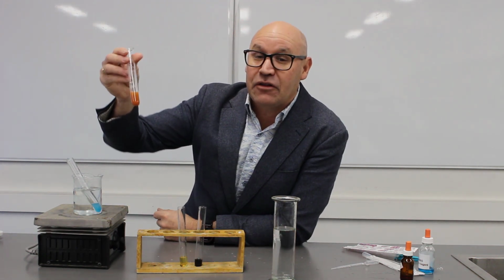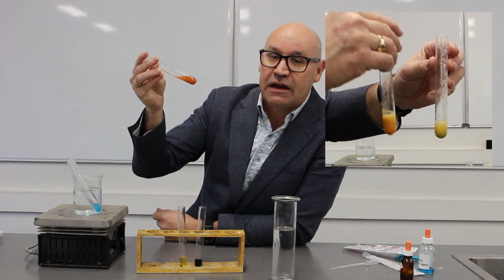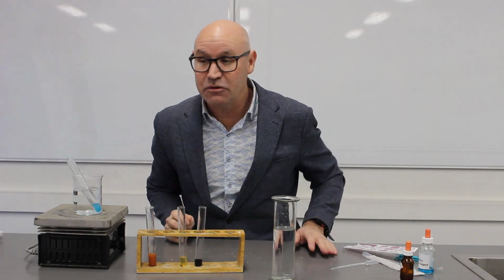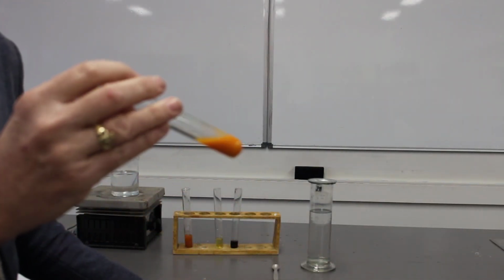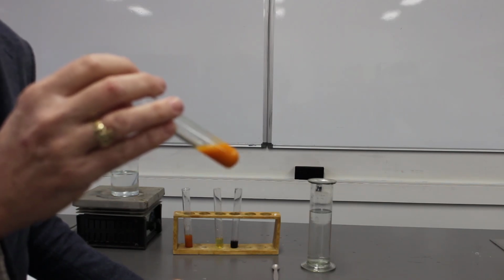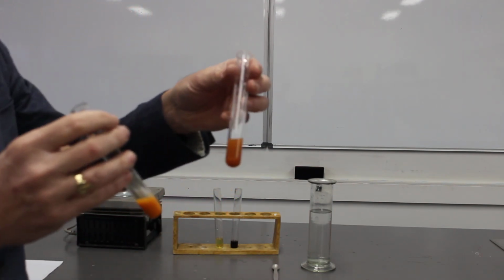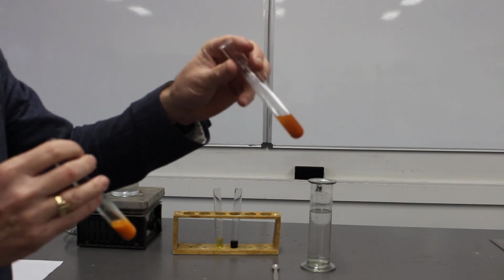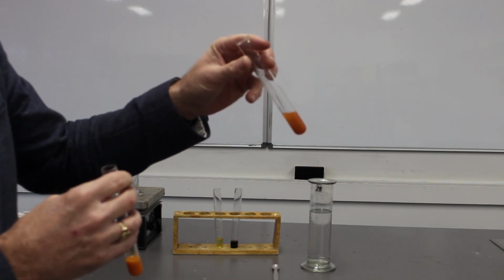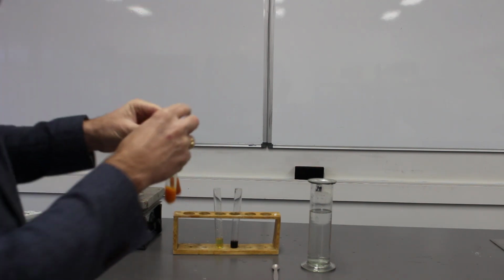If we compare that to the colours that we had yesterday, you can see that that's actually a stronger precipitate than we had yesterday. And we'll just keep an eye on this one here. This is taking the water straight from the tube. Alright, so this is the Benedict's test for the water that was inside the tube. So it's definitely a positive test. Interestingly, this is the water outside the tube. Now it's been sitting for a little bit longer, so maybe that's why it's more of a red colour. But it's certainly a stronger red brick than that, which is a little bit interesting.